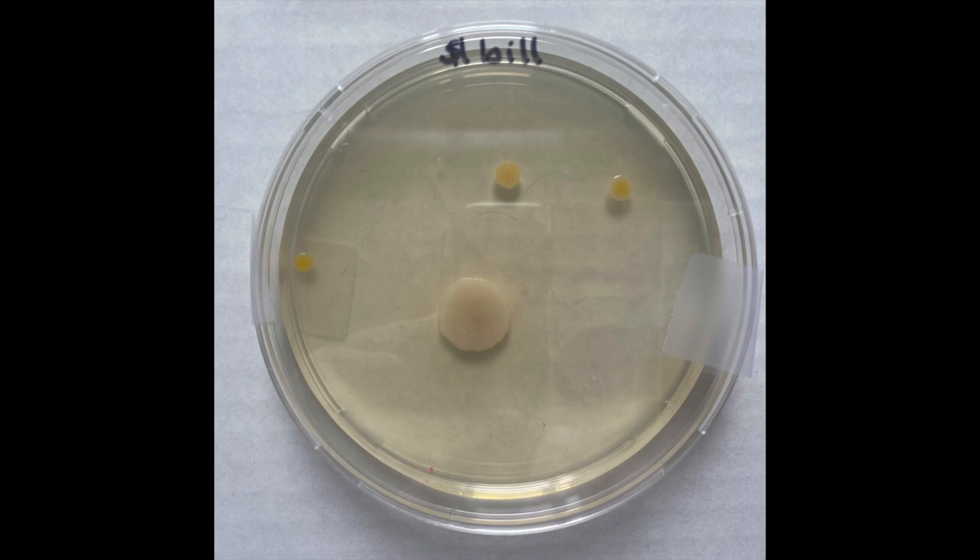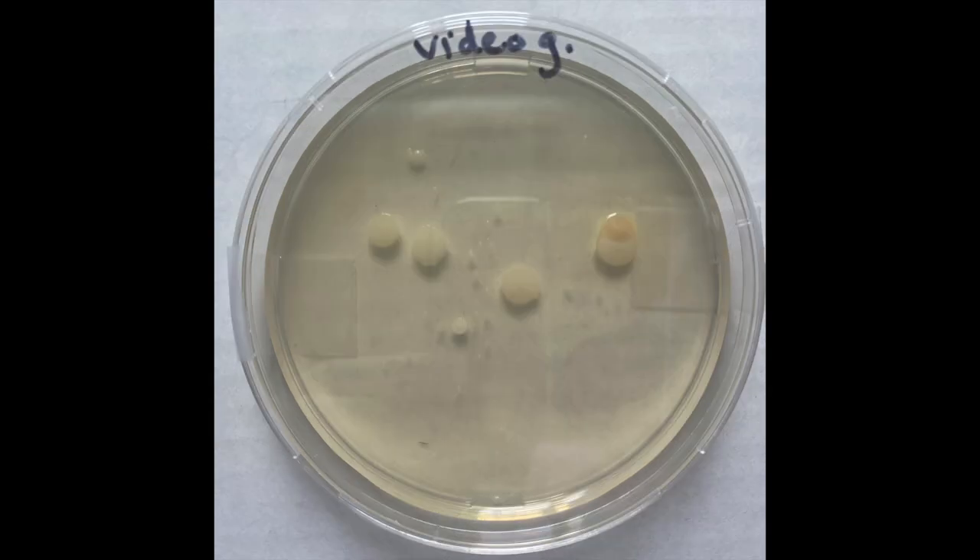Interestingly, the dollar bill plate shows colonies very similar to what we saw on the hands one plate. You'll see this as well with the next plate, which is the video game controller. Think about a dollar bill and a video game controller — the primary source of bacteria on these will be the hands that are touching them. It makes sense that the colonies you isolate from these would be similar.